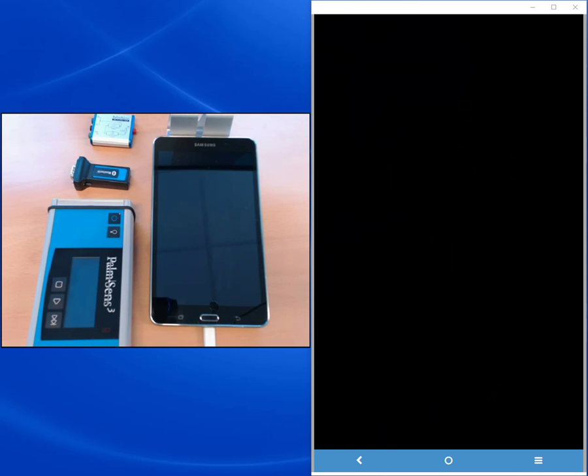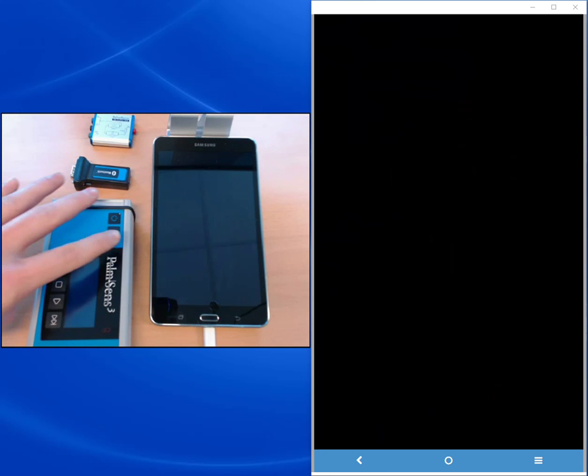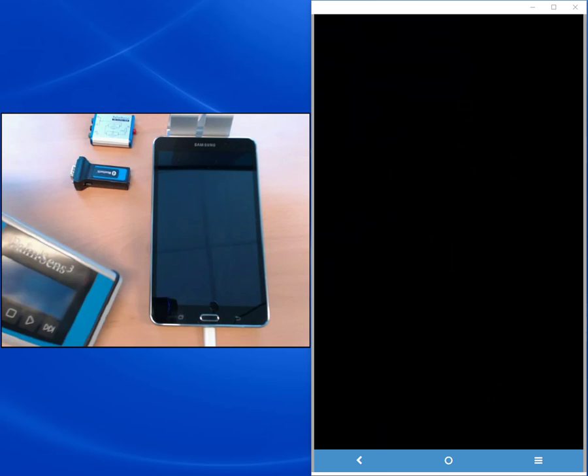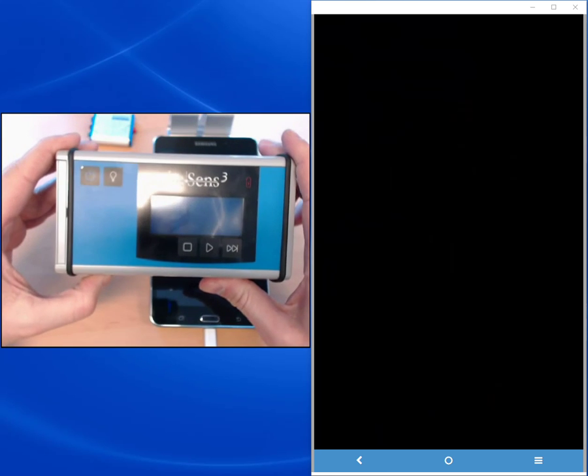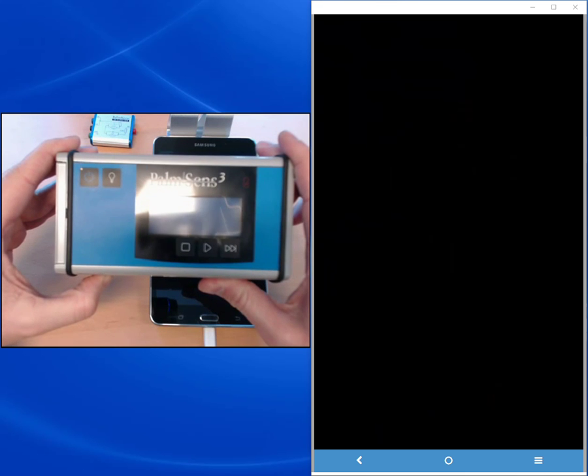The Emstat series is unfortunately not capable of performing impedance spectroscopy. This is why I'm using for this demonstrational video a Palmsense 3. The Palmsense series starting with the 3 is capable of doing impedance spectroscopy.